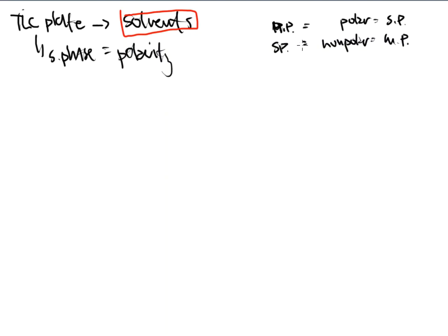What kind of stationary phase do you need? That's typically where we start. And then when you pick out that stationary phase, you'll then pick out a complement mobile phase to go along with it. Now, that's not to say that we can't put polar mobile phases into the picture, because we can. Sometimes it does work.